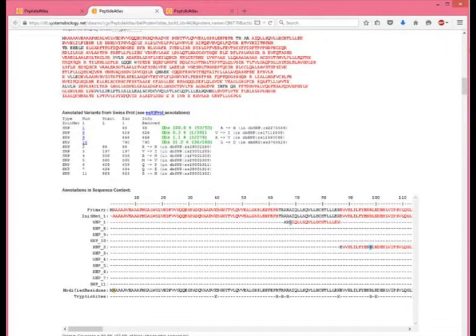This is a little bit further down the page, and this is a different view where all the red sequence has been seen, and you can see the different peptides. These peptides are broken out as tryptic. You can view this as tryptic, or you can view it in the normal 10 by 10, or 10 amino acids as a block, kind of view. But this shows again that we've seen almost all the tryptic peptides, and the ones we haven't seen are just too short, or in some cases too long. And it looks like it's not 50, maybe 30.